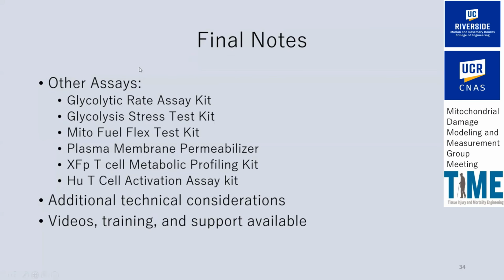Hi, Shane. Nice presentation. So you talk about when you normalize these data, typically a typical way to do this is to normalize to the amount of cells, right? So then the cell counting becomes very important in terms of getting an accurate number, right? So what is your strategy in terms of getting the reproducible or accurate cell number?